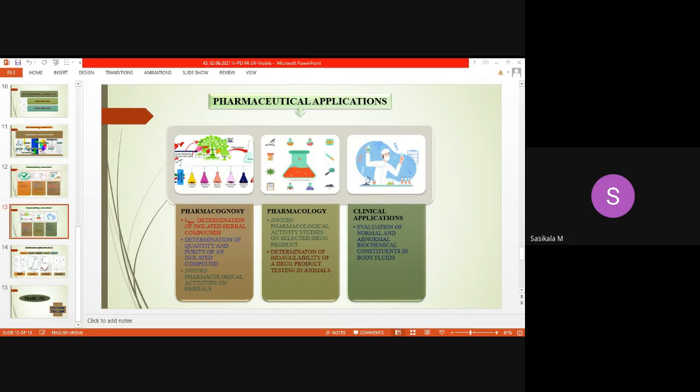For Beer-Lambert's law derivation, some people have copied as such from the Ravi Shankar book, the textbook. In that book, all the steps have not been explained. You could find all the steps easily defined in the PPT.